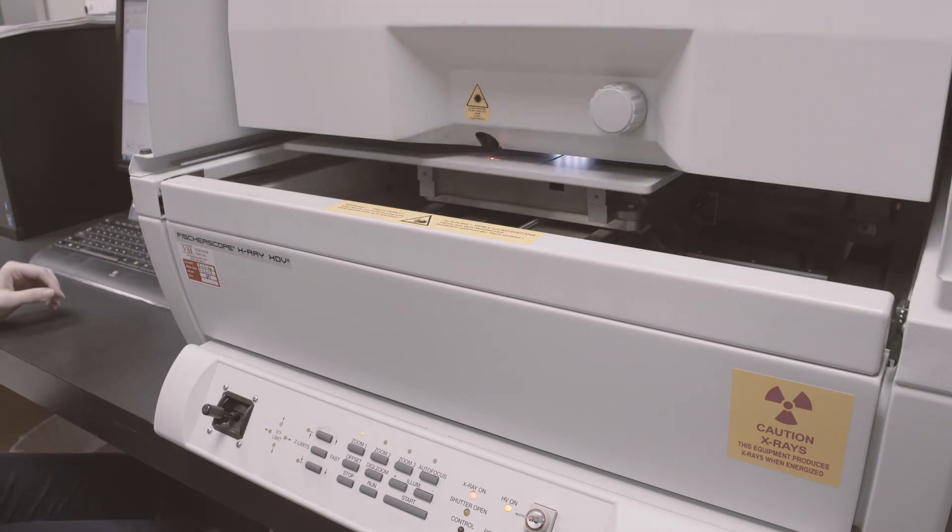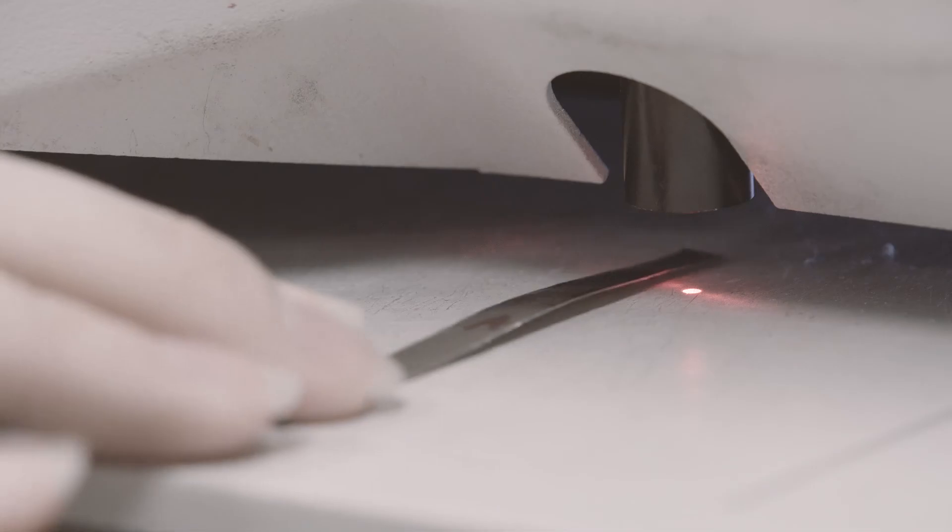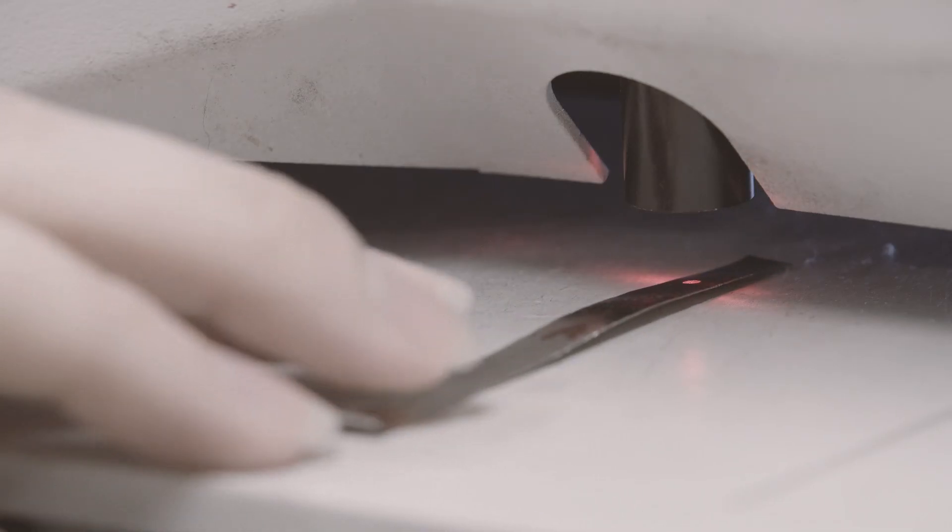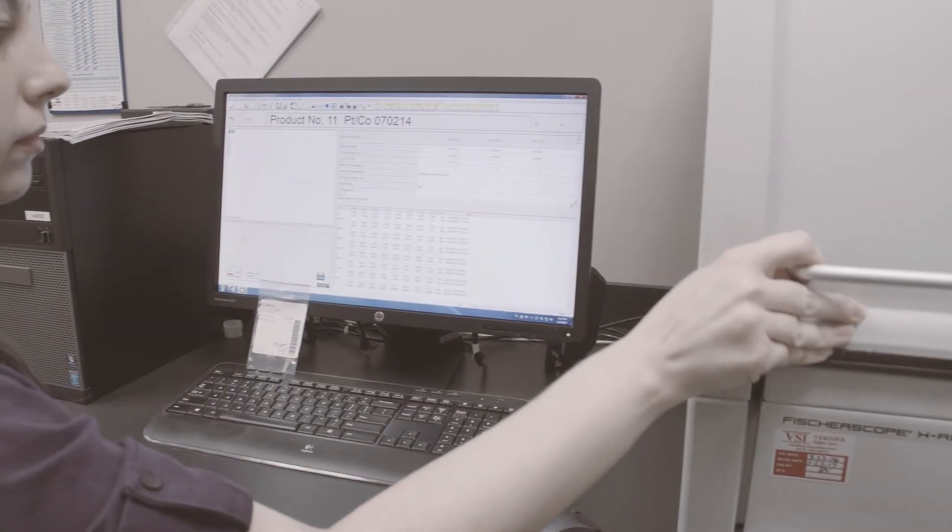For the other metals, the lab uses an X-ray fluorescence machine, which uses computer technology to determine the components in that sample.